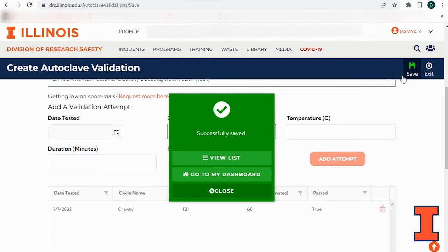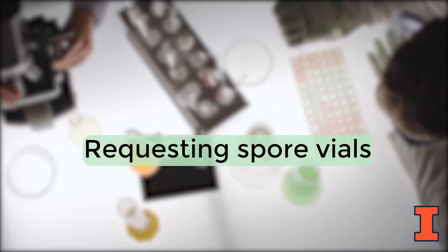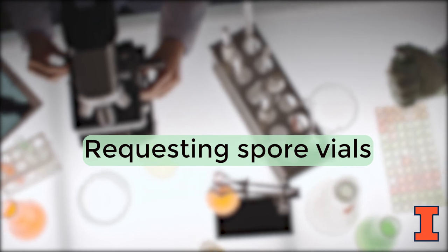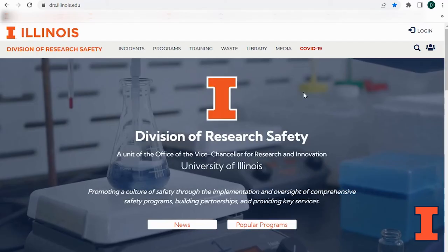For shared lab spaces, only one validation needs to be performed monthly for waste generated from multiple labs. However, results should be entered individually for each lab. Spore vials and starter kits can be requested from the DRS website if you are enrolled in the validation program due to an IBC project requiring you to autoclave BL2 materials.